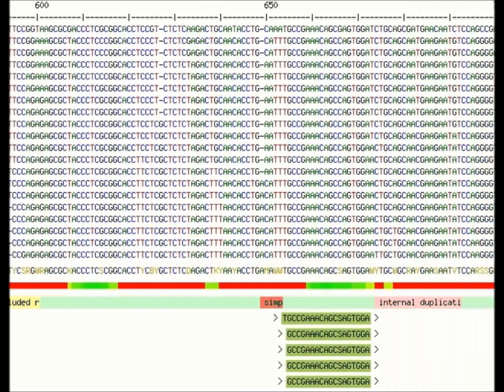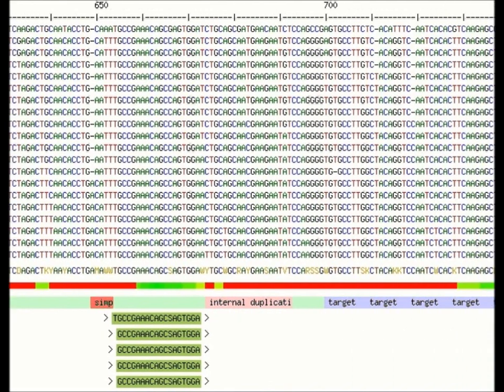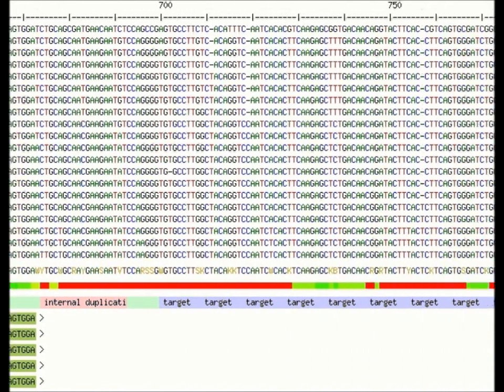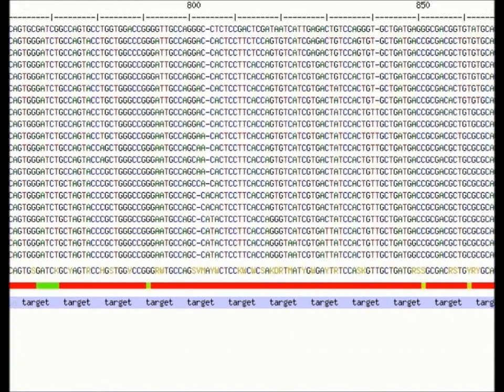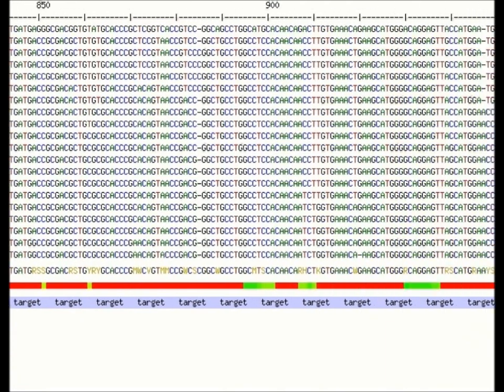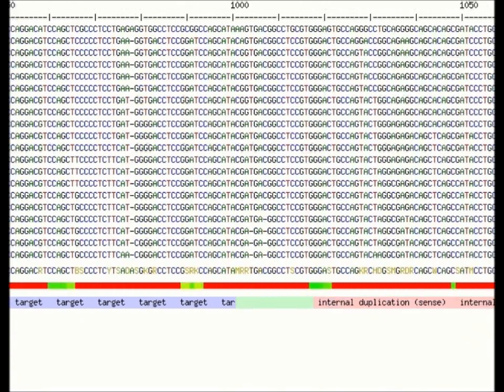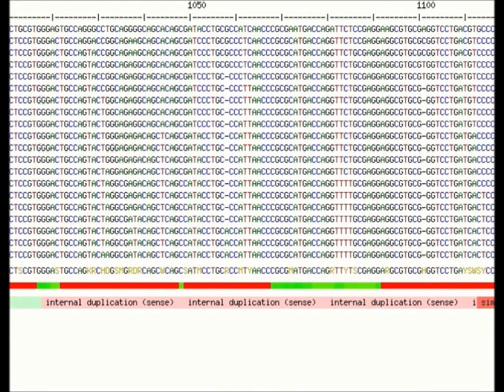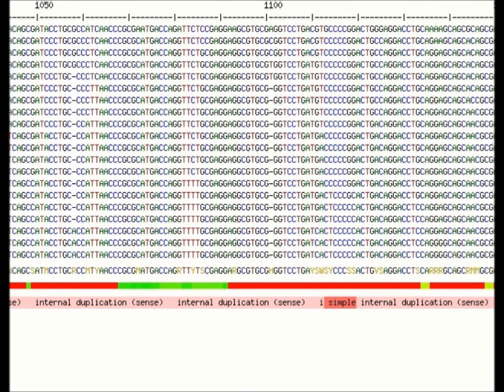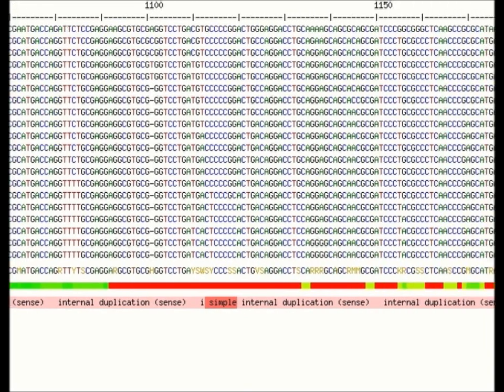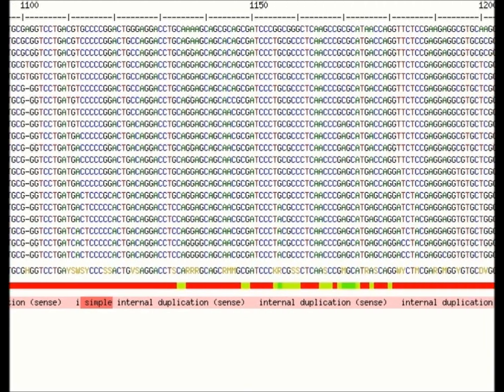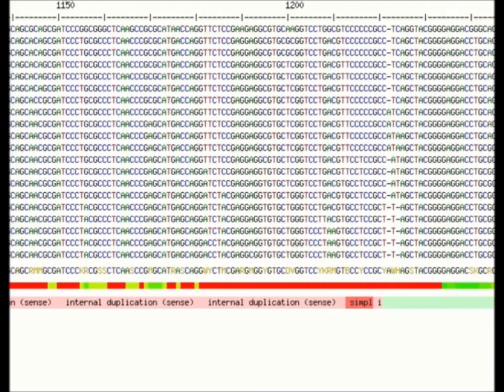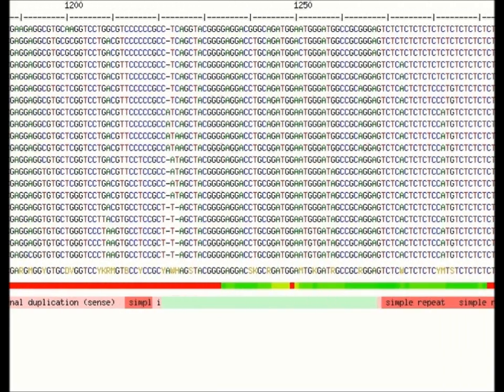Here we can see the suggested forward primers followed by the target sequence. Internal duplications like tandem repeats will also be identified and rejected as possible primer targets. Finally we can see the position of the suggested reverse primers.